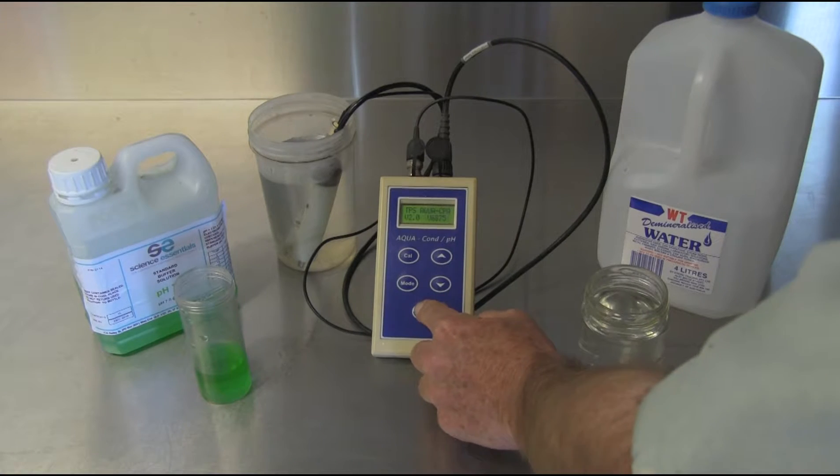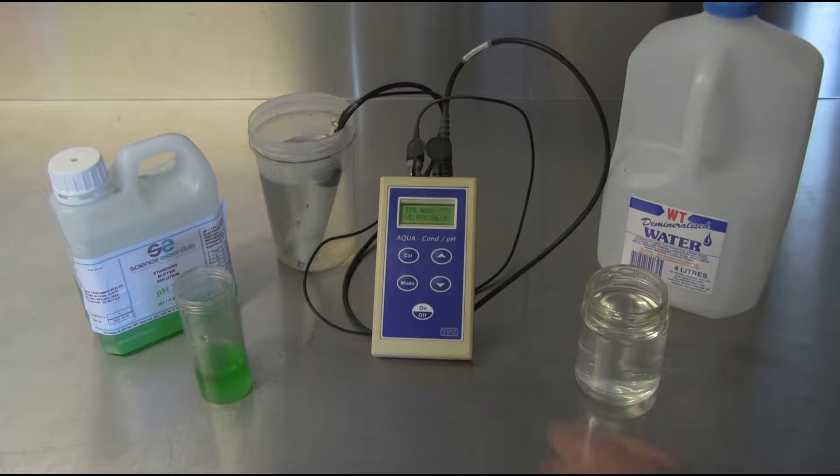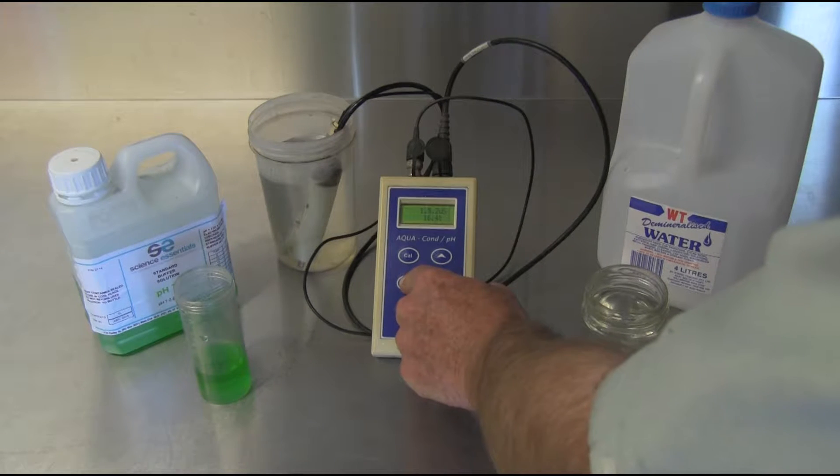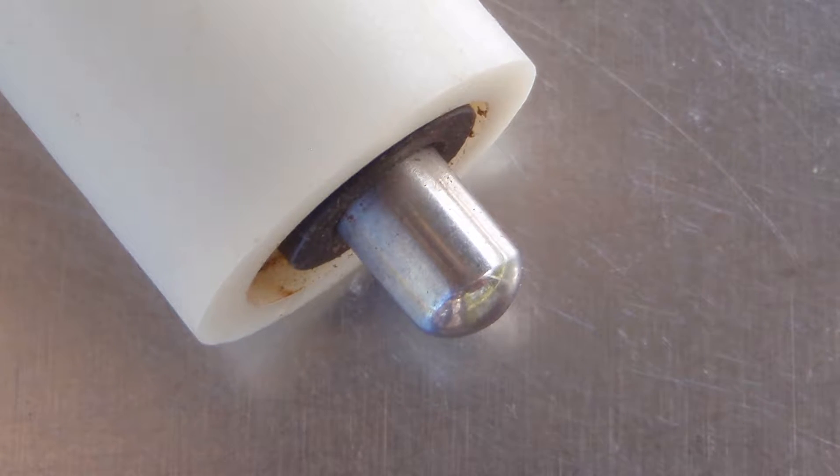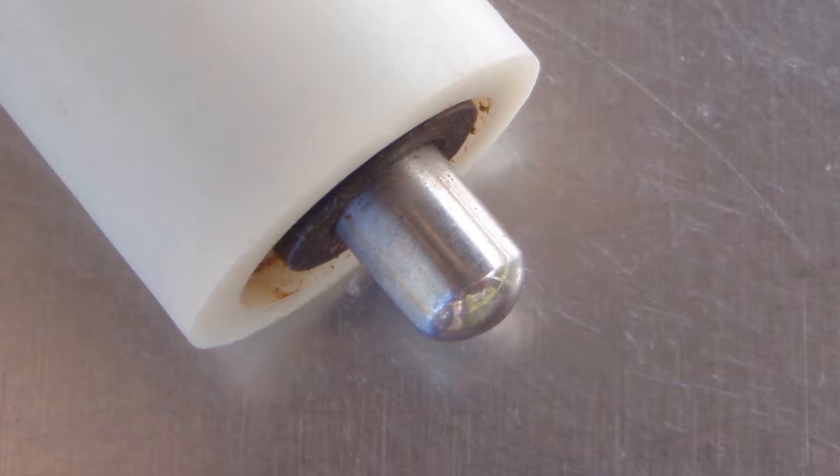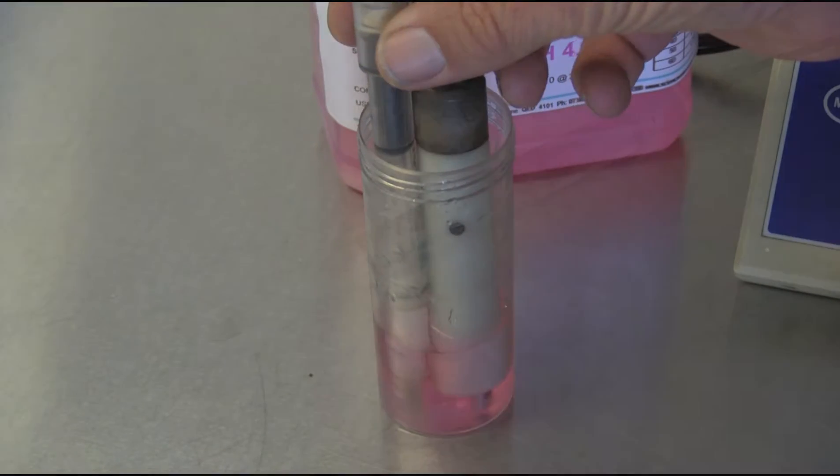Turn the meter on. Select the calibration mode and allow the readings to stabilize. For meters having automatic temperature compensation, the temperature probe must be in the same solution as the pH probe.